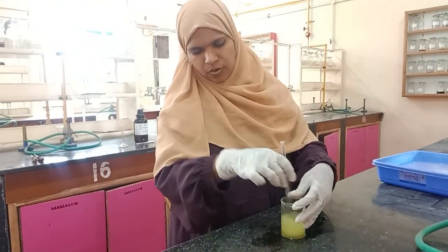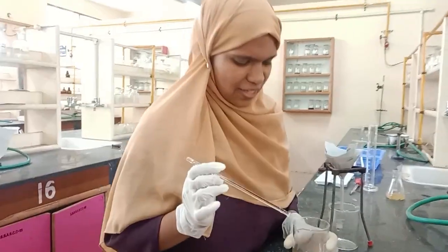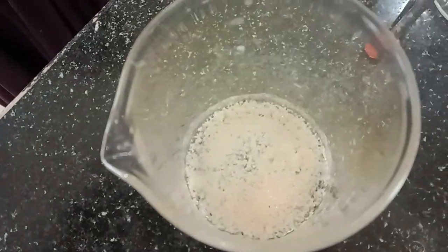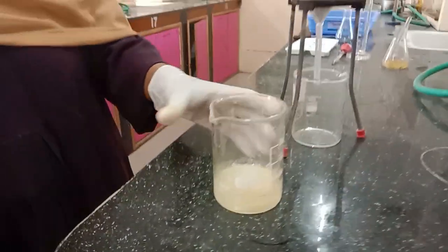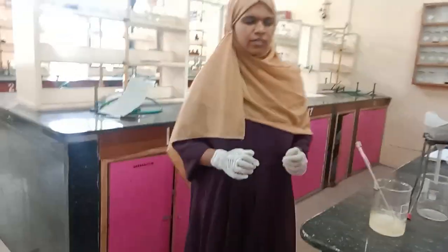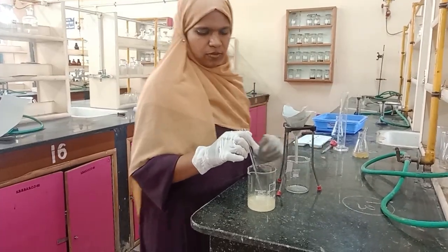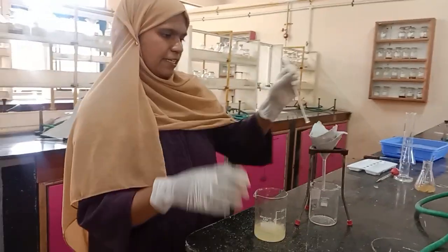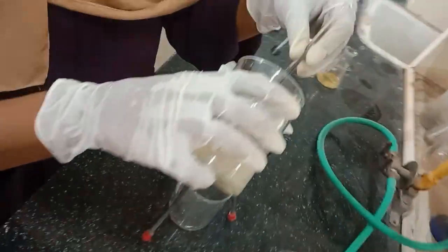Then pour this mixture in ice. Then this solid precipitate appears. It is a creamish white solid, or sometimes it shows a yellow color. In this practical, if the heat or temperature is not maintained, your crystals will form sticky. So the important thing in this practical is to maintain the temperature.